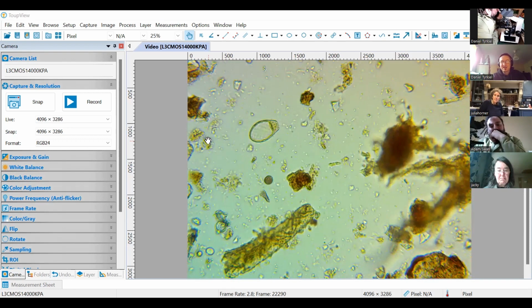They're very easy to see. They're quite mobile. They ooze from side to side. And then you will also see a lot of ciliates of various sizes and potentially other organisms as well.